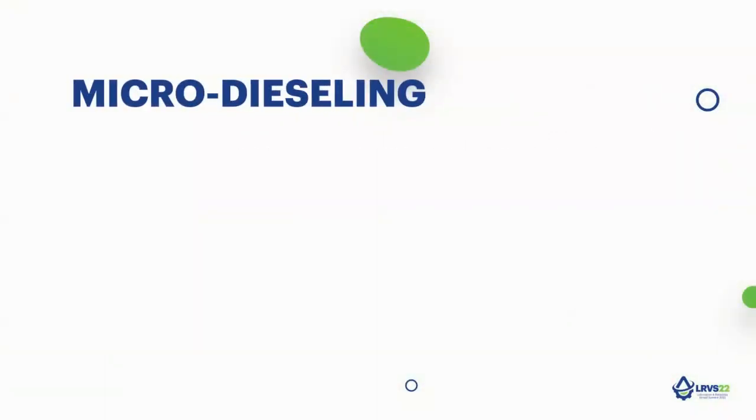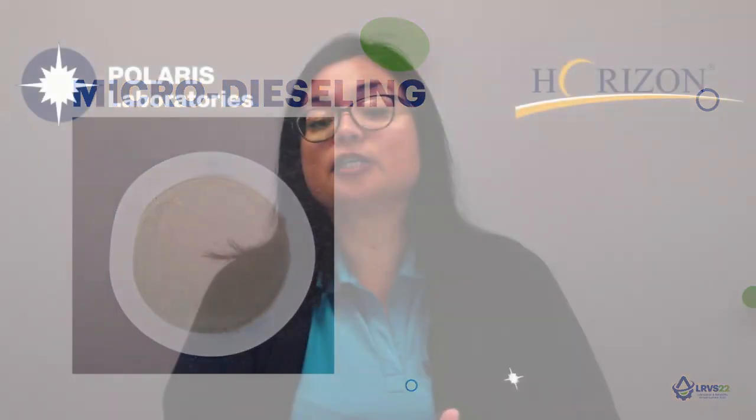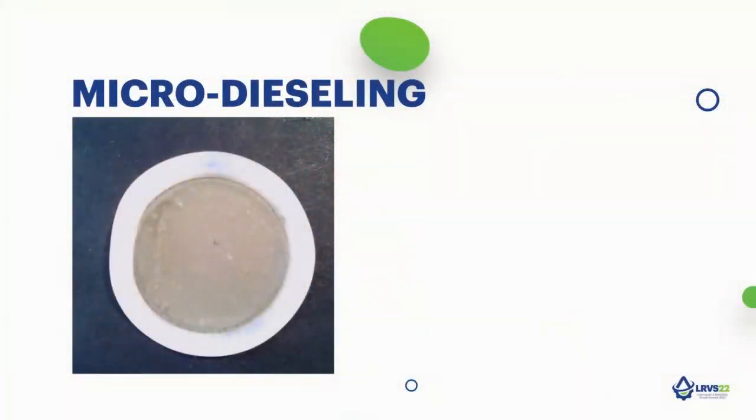Microdieseling. Here is an example of what a micropatch analysis and varnish patch can share and highlight. The patch on the left-hand side is very gray in color. That's an indication of microdieseling taking place. I had a customer reach out to let me know that there was a failure on a steam turbine in a nuclear plant in Europe, and they needed to know if the crystal-like or clear-like formations they found were varnish. I recommended doing a micropatch because our standard varnish analysis tests weren't highlighting anything additional.